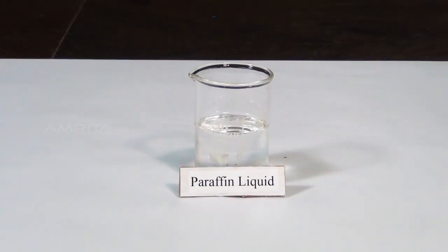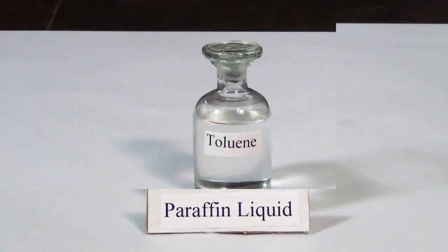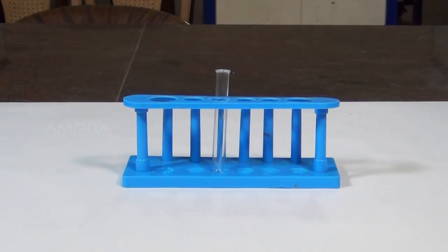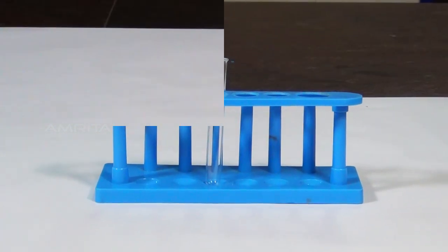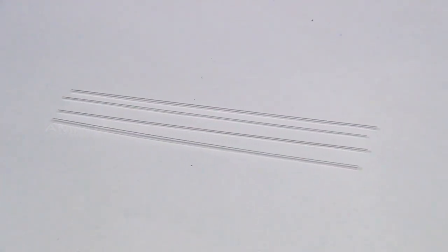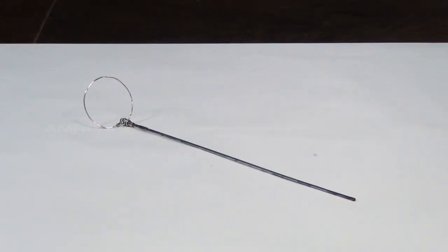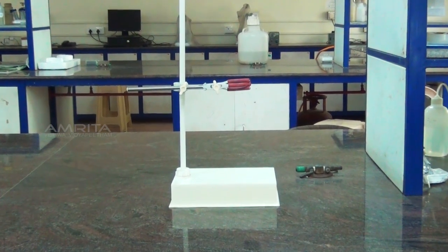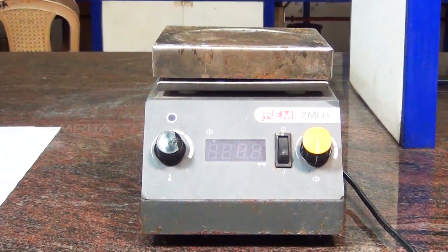Liquid paraffin in a 100ml glass beaker, toluene, a small thin walled test tube, thermometer, capillary tubes of approximately 5-6cm length, dropper, rubber band, stirrer, stand with clamp, bunsen burner and a hot plate.